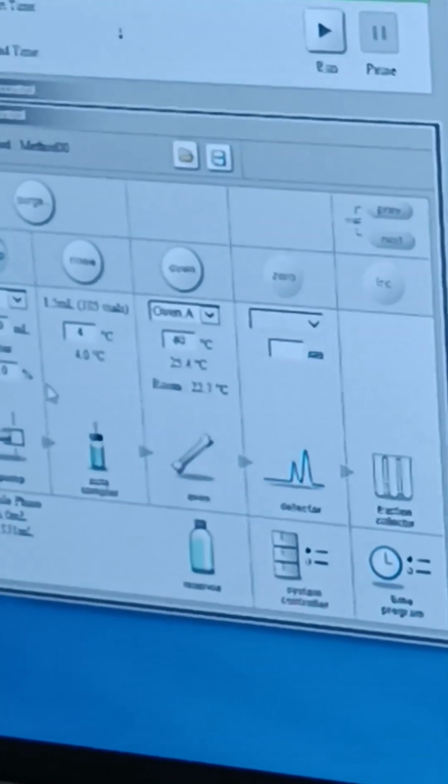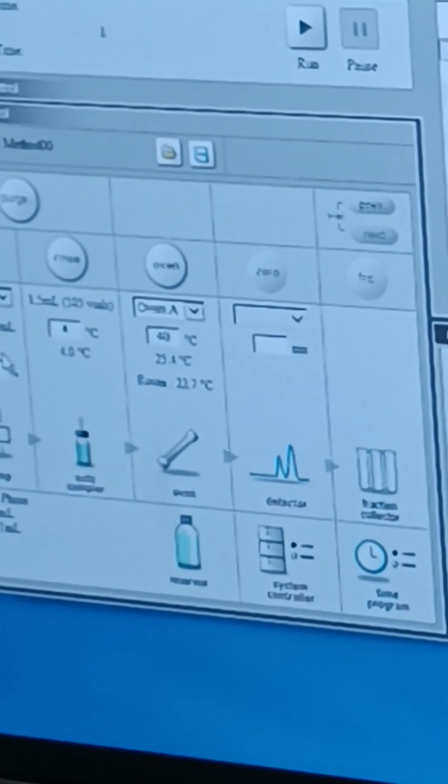At least you get a hint of what benchmark the pressure will stop at. Because if the pressure here is anything higher than whatever you expected, then it means that your column is probably contaminated. Yeah. So this is a good benchmark that you guys should know.